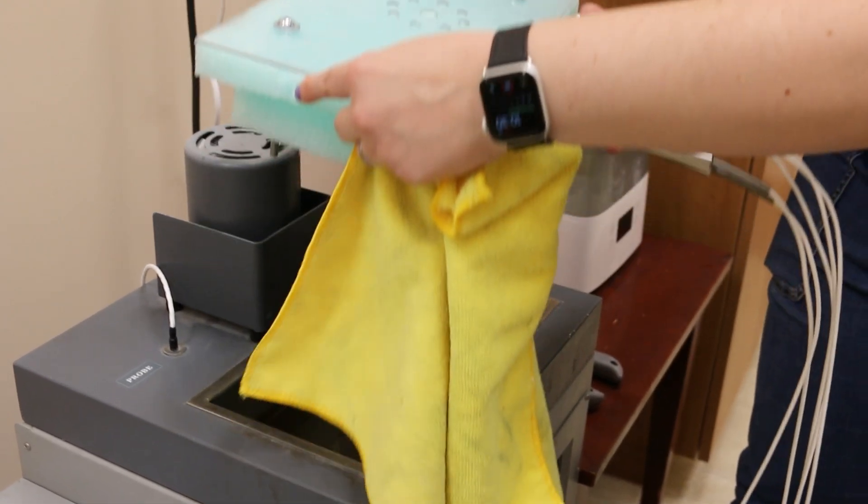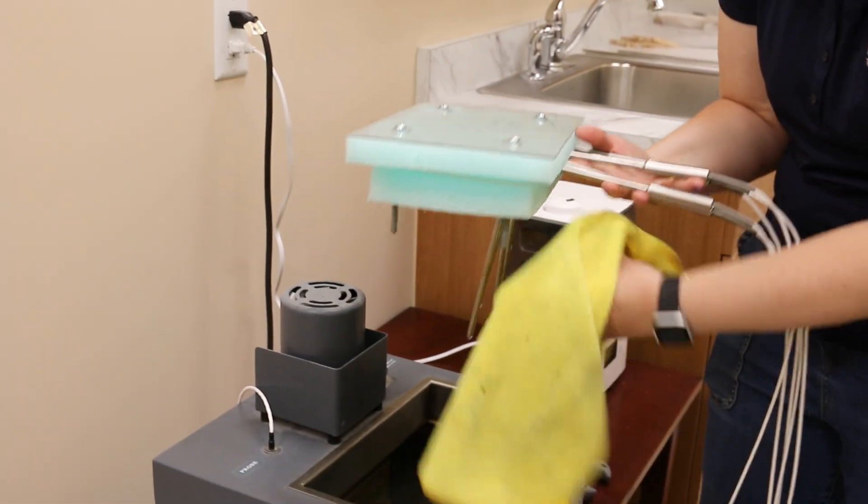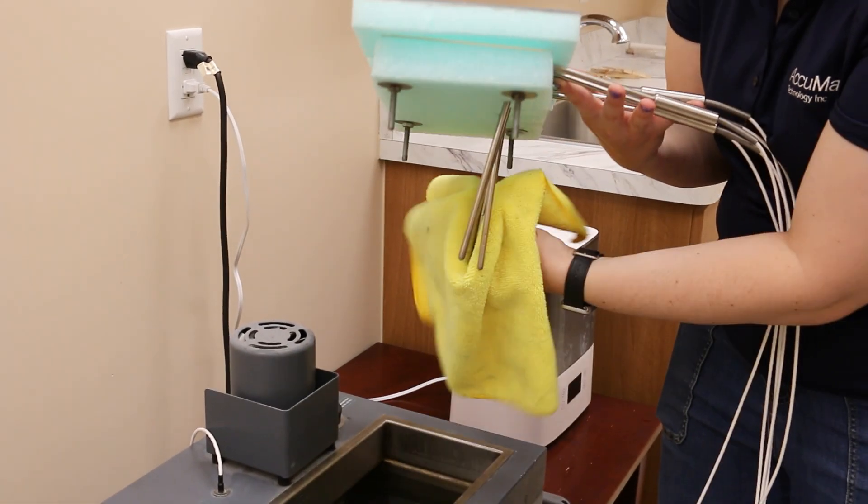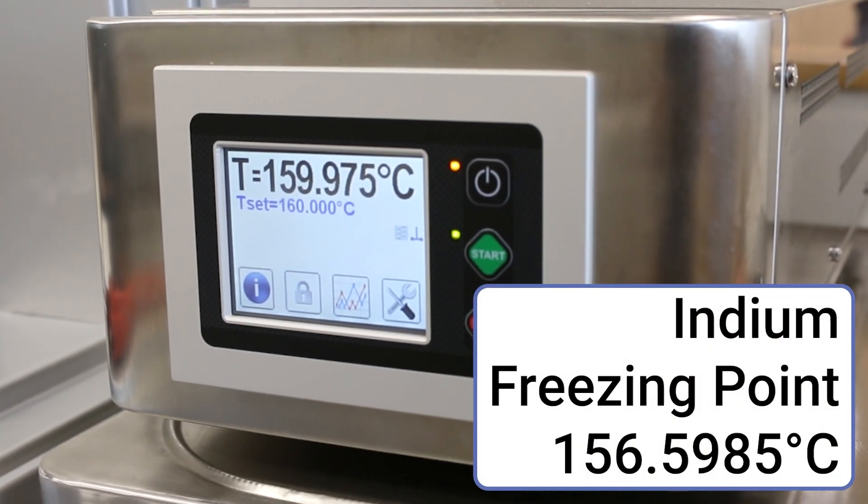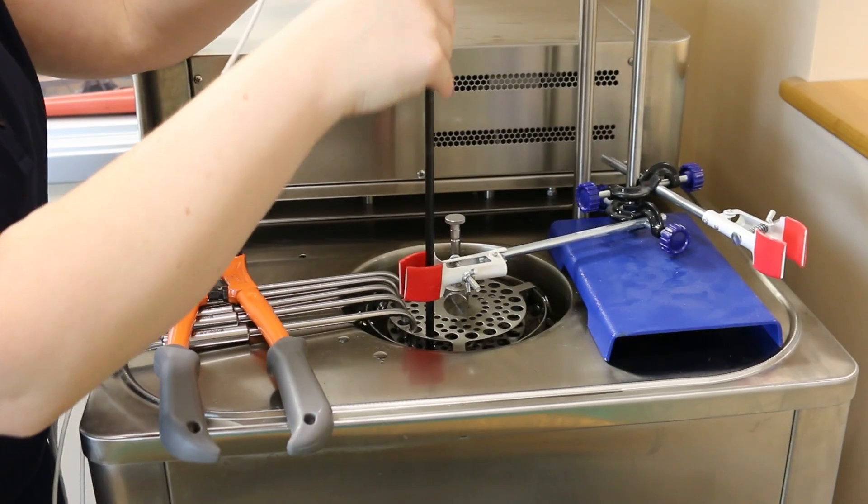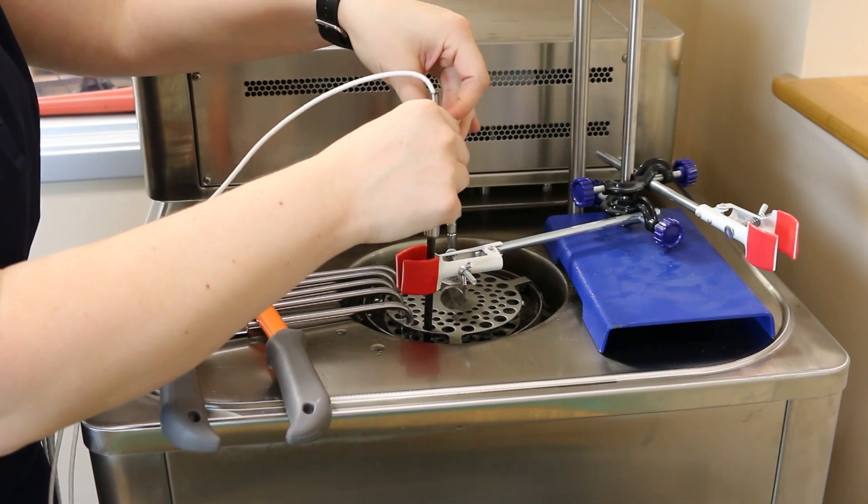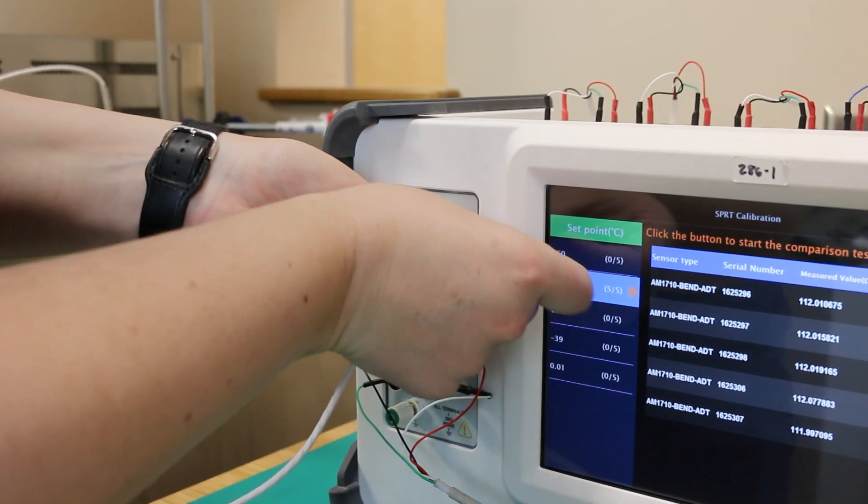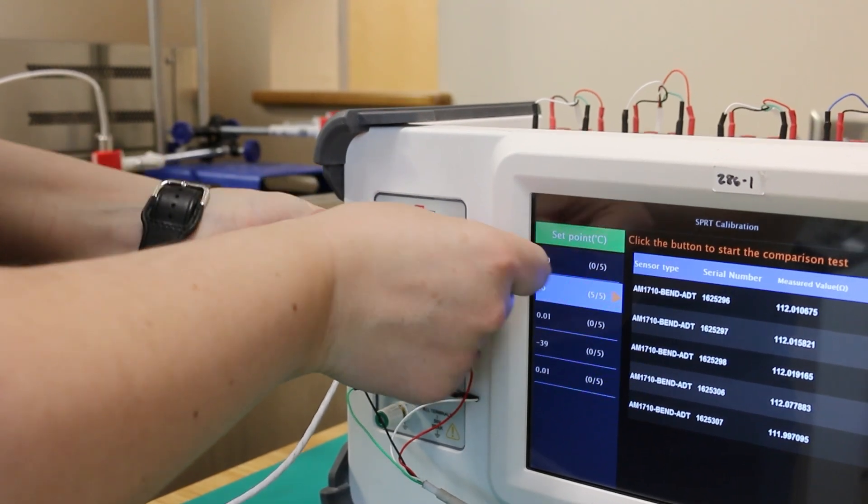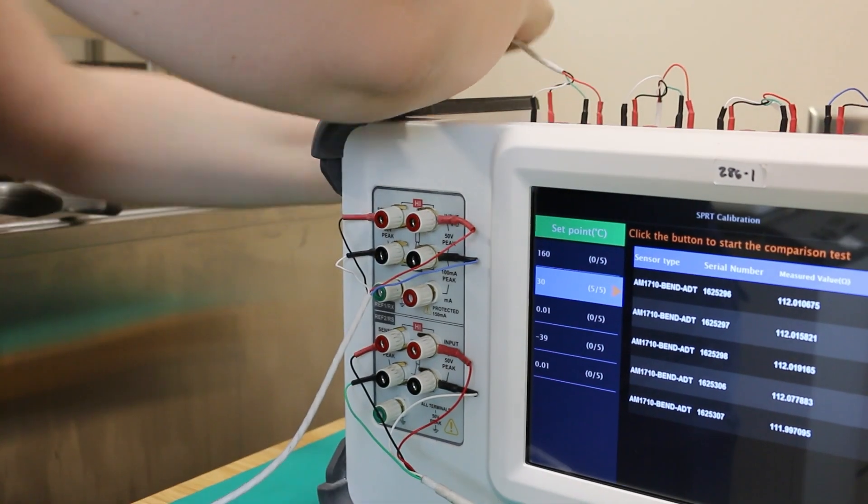Once the test is finished, remove and dry off the probes before proceeding to the next calibration point, which will be set to 160 degrees Celsius as a comparison against the freezing point of Indium. Insert the DUT probes and reference probe into the bath, and connect them to the 286 in the same way as previous calibration point, with the five DUTs connected to the top ports, and the reference connected to REF1.